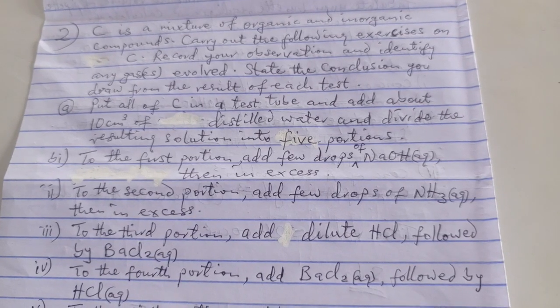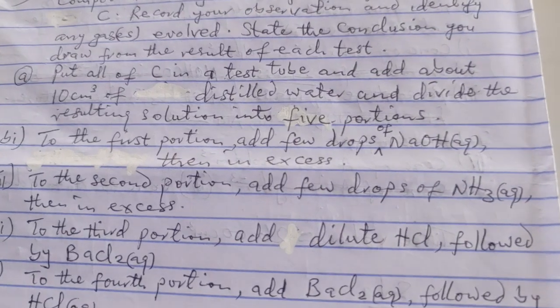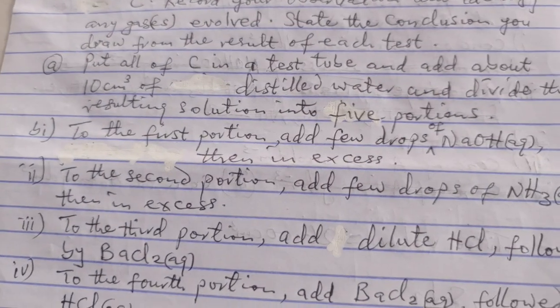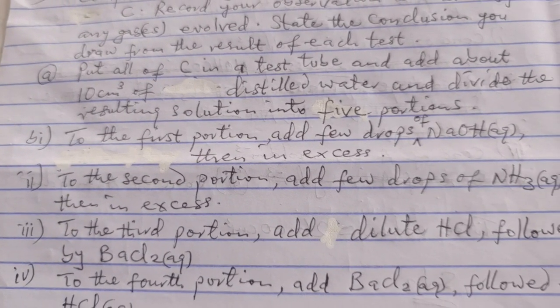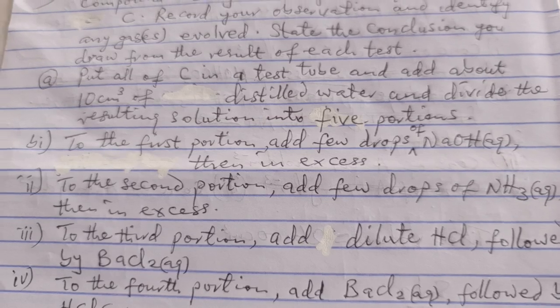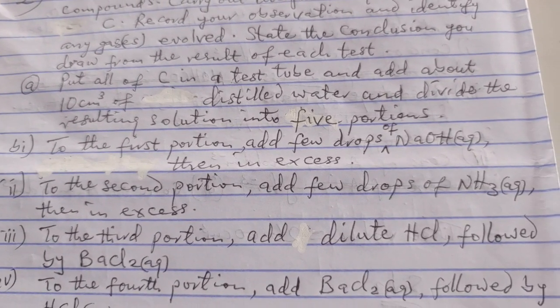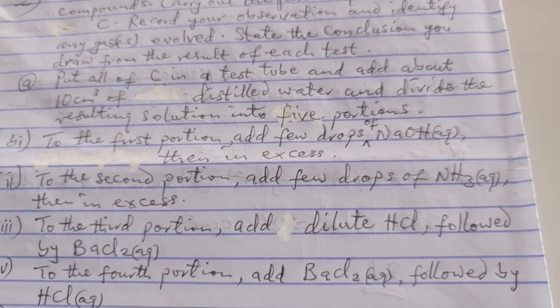State the conclusion you draw from the result of each test. A. Put all the C in a test tube and add about 10 cm cube distilled water and divide the resulting solution into 5 portions.